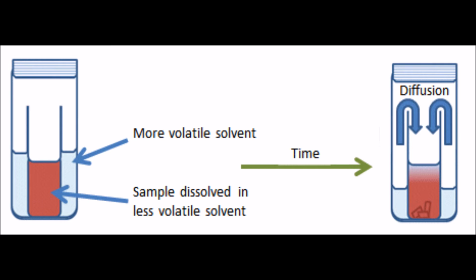You want to prepare a solution using the solvent and the compound and place it in a small, open container. You then want to put this container inside of a larger container which contains some of the precipitant. You then want to heat the entire apparatus to a temperature that's above the boiling point of the precipitant but below the boiling point of the solvent. This heating will turn the precipitant, which is more volatile, into a gas, which will diffuse over the solvent, leading to oversaturation, nucleation, and, if everything goes well, crystallization.